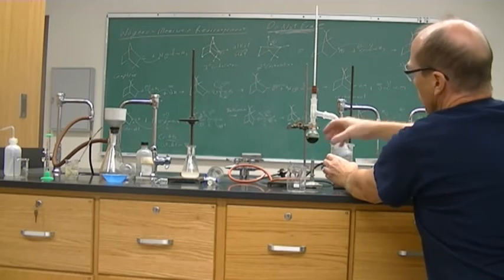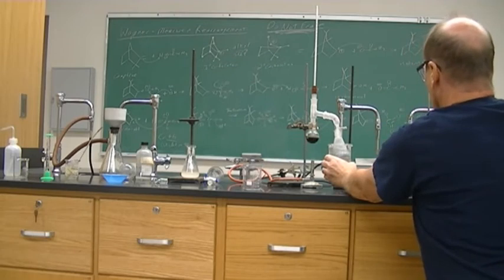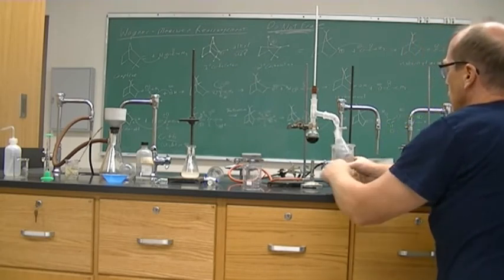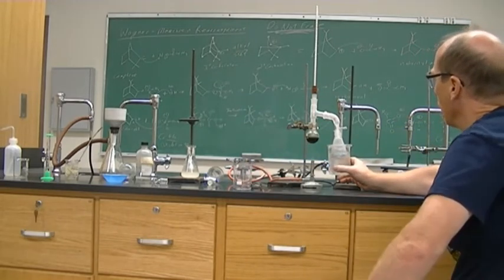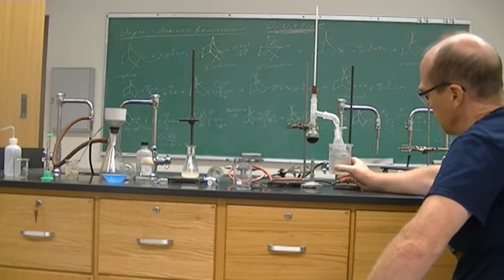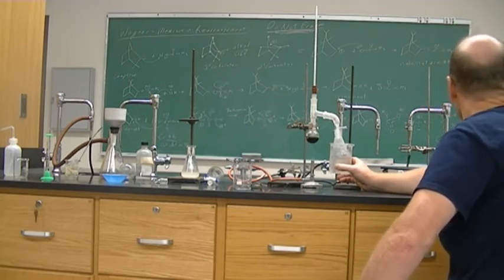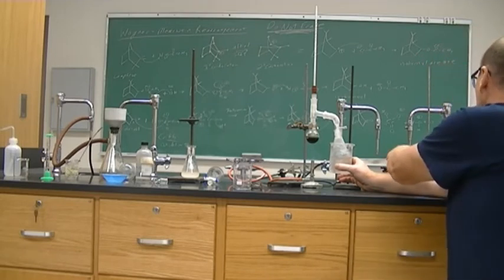I saw steam coming out. I know that it's escaping. I don't want it to escape. So I want to keep the size of this flask hole. I have a book. That would be great. This lab jack won't go well enough.